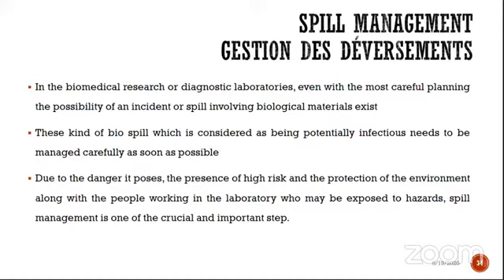So in a biomedical research or diagnostic laboratory, even with the most careful planning, the possibility of incidents always exists. Any biospill which is considered potentially infectious needs to be managed very carefully.